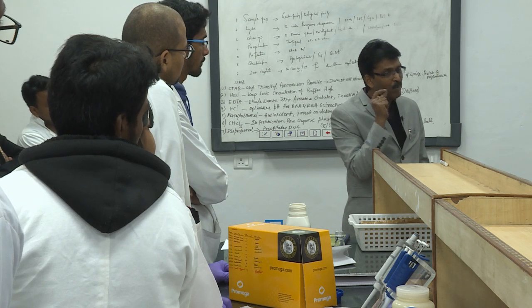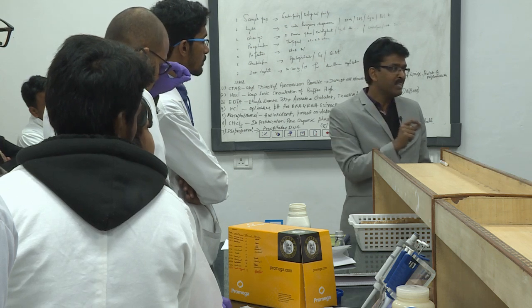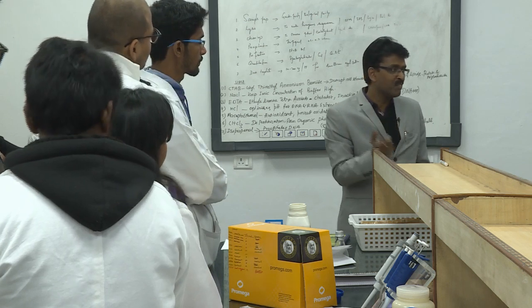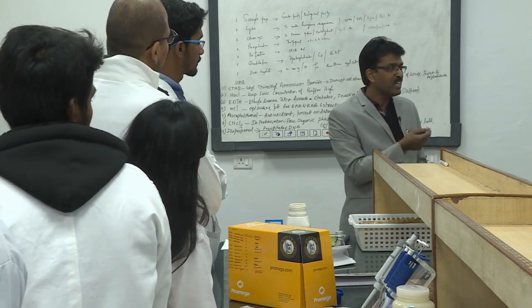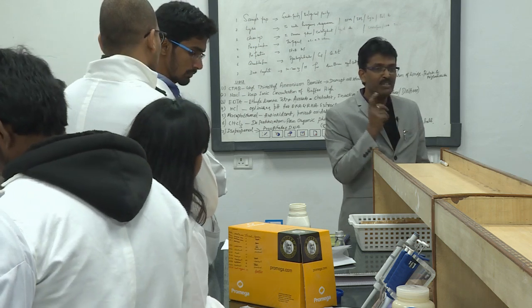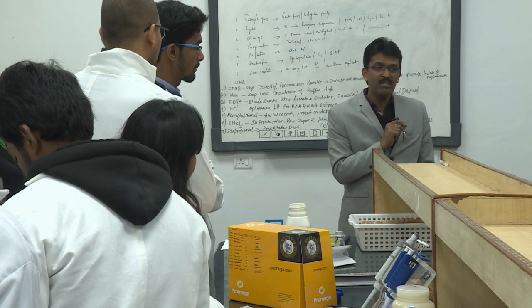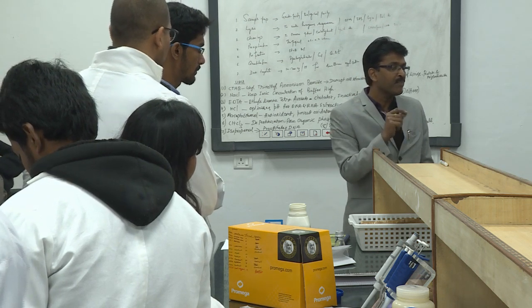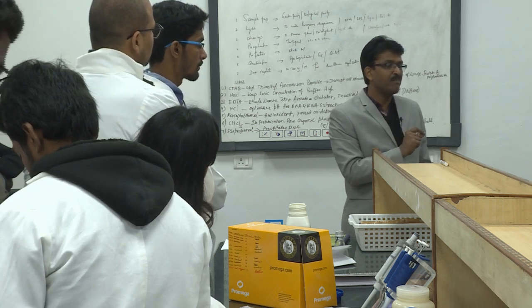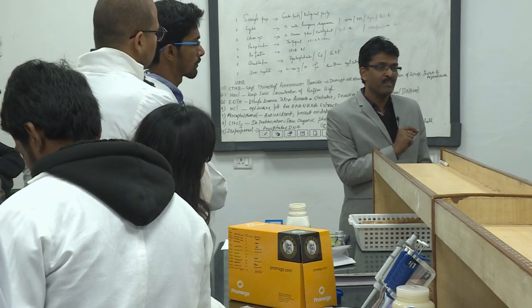Probably you have used water to dissolve so much DNA, right? A small quantity of DNA dissolving in water is okay. If it is a big quantity, in excess of 300, 400 nanograms, it takes time. Yesterday also I told, it takes efforts. For example, you need TE 10:1. Somebody was asking what is TE 10:1. 10 millimolar Tris and 1 millimolar EDTA, 37 degrees Celsius incubation should be sufficient, and overnight at 4 degrees, I am sure your DNA will be completely dissolved, right?